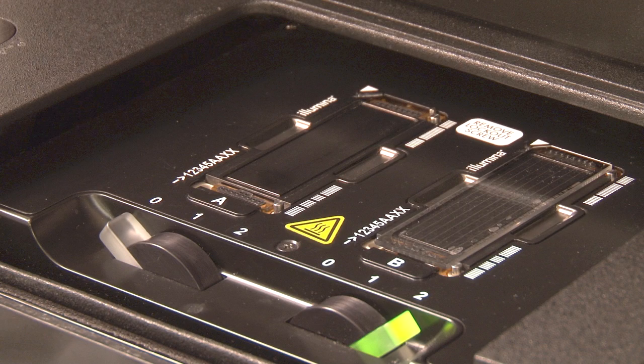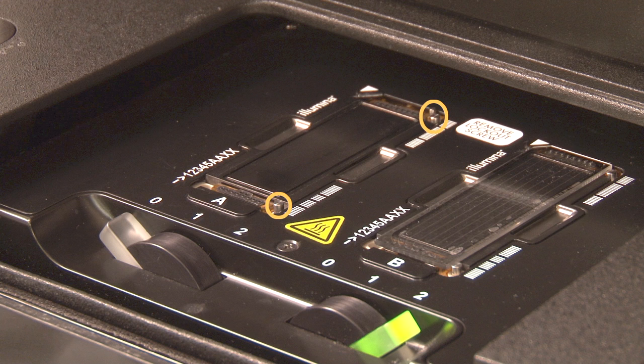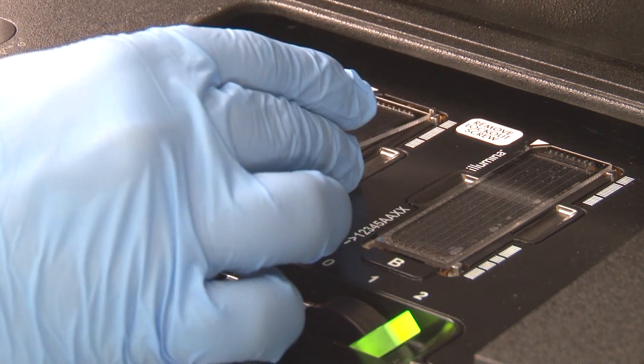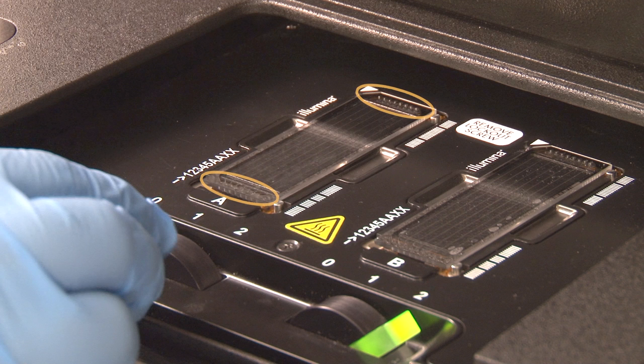When loading a flow cell onto the Hi-Seq, make sure to register the flow cell against the guide pins in the back right of the flow cell holder. Visually make sure that the inlets and outlets of the flow cell are positioned above the inlet and outlet gasket opening. Some minor position adjustments may be made to the flow cell to ensure proper alignment with the gaskets and proper flow.